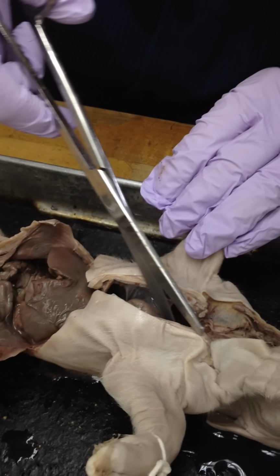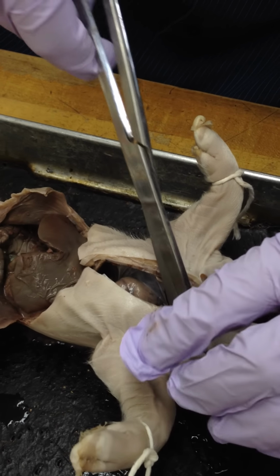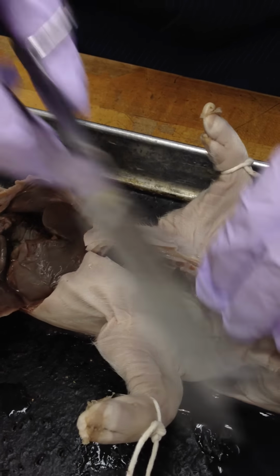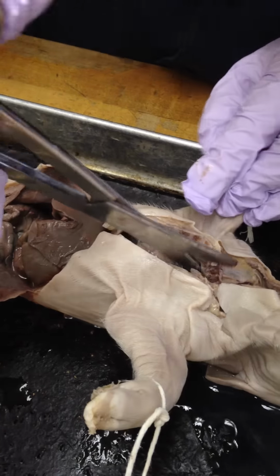Go through the clavicle and muscles. So you cut from here to here, down, and then I guess it's a Y going in the same direction. Oh, okay, gotcha. I thought there were better pictures in here. Snip. Yeah, these guys go through.